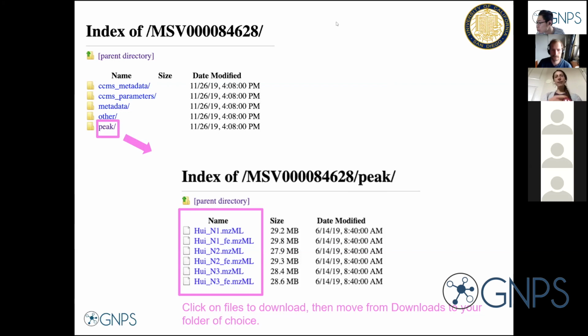And as we go through the processing of these files, if you have troubles at any stage, can you just send a message on the chat, and we'll respond to your message, or we'll bring up the question to the group if it's relevant for everyone. So I'll give the floor back to Daniel.